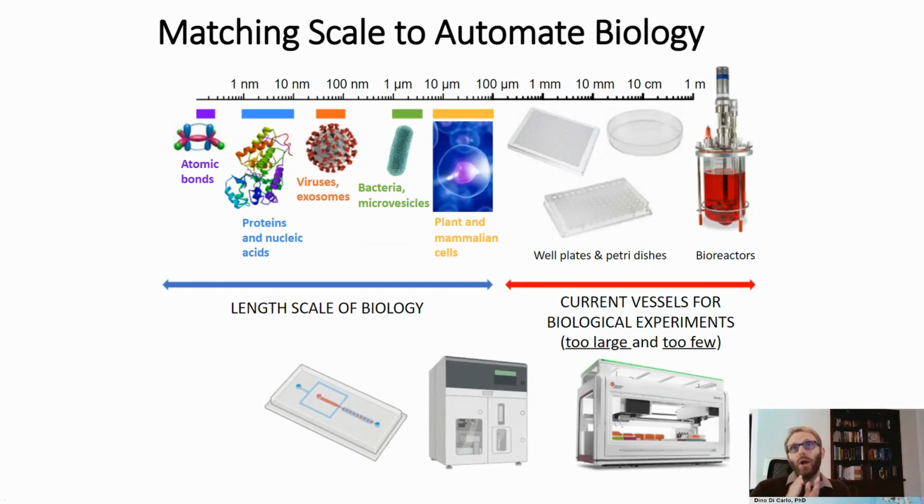So we need to try to match the volume scale on which we analyze cells to the scale of the biology. And that's where microfluidics tools have played a role. But what we've seen over the years is that being able to adopt new microfluidics tools has been a bottleneck, right? We have a lot of tools like flow cytometers that are in labs already, but we don't have new microfluidics tools, especially if we need a new instrument for each niche application.